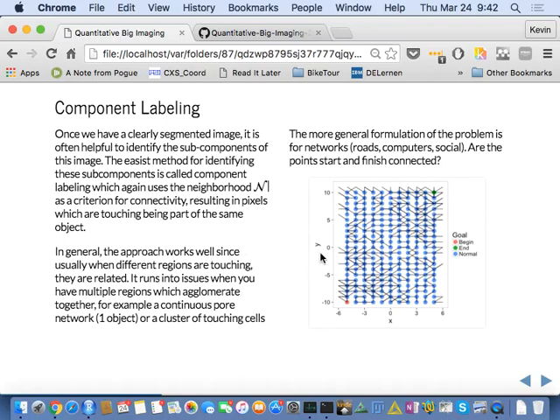One of the areas where that's really important is brain imaging on animals. You use dyes that you insert into their blood, and it flows around, and then you try to extract the vascular structure of the brain. The problem with a lot of these dyes is that they don't fill in completely, which means you end up with large gaps between vessels. If you're trying to figure out how well the blood vessel network is connected or how blood flows through the system, then you need an idea of which vessels are actually connected together. And if you have a bunch of gaps everywhere, then that doesn't work well.